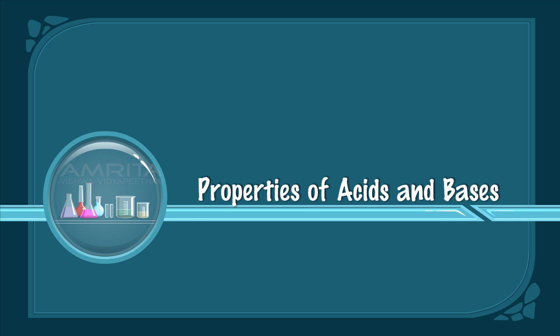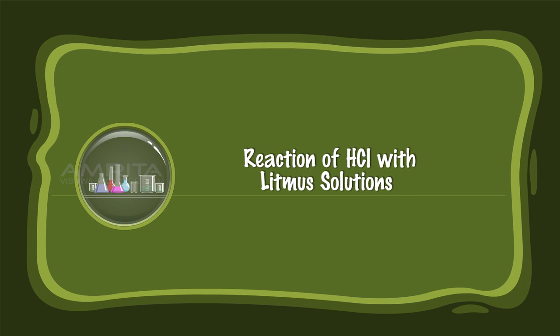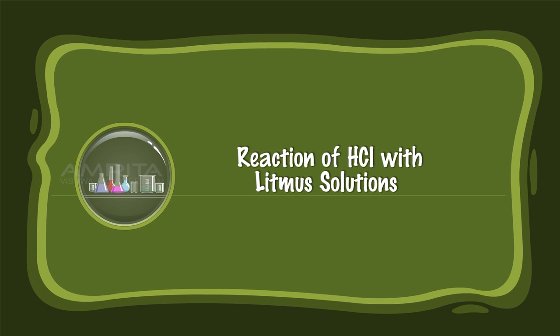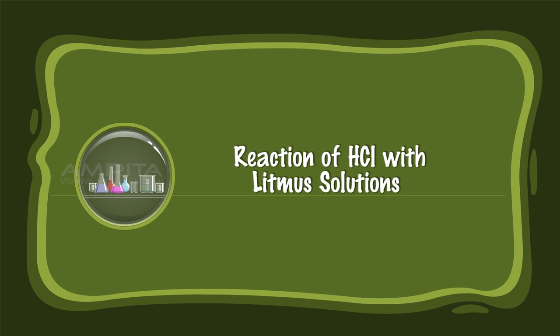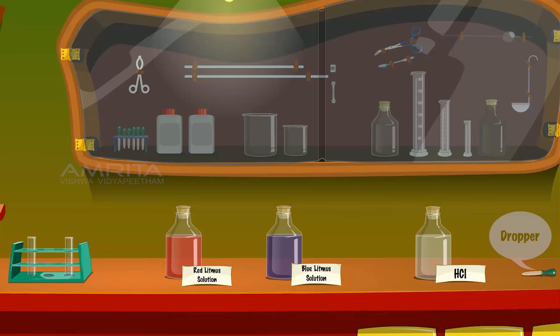Properties of Acids and Bases: Reaction of HCl with Litmus Solutions. We require two test tubes placed in a test tube rack, red and blue litmus solutions, HCl solution, and a dropper.